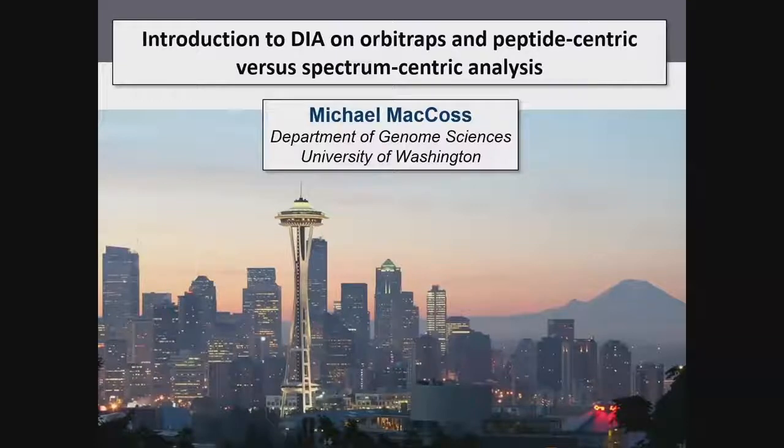Mike, please. Great. All right, thanks. It's great to be here, and also great to see so many people who are interested in this new data acquisition strategy. I say new, but it's actually been around for a while. It has just gained a little bit of resurgence as instrument hardware has caught up with the ideas and the methodology, and of course, a lot of software is finally getting caught up to some of the ideas as well. So I'm going to give you a little bit of an overview from our perspective on DIA. I'll give you a little introduction on Orbitraps, and also a little introduction of what we mean by peptide-centric versus spectrum-centric analysis. This will feed into a couple of other discussions that occur later in the week.